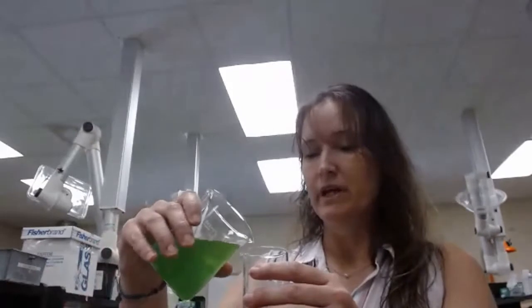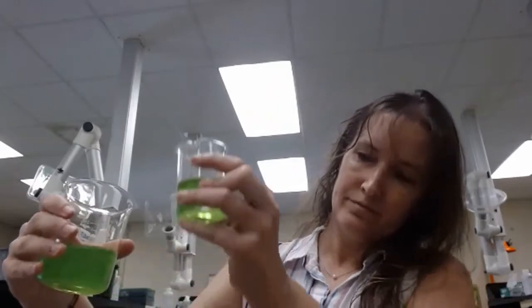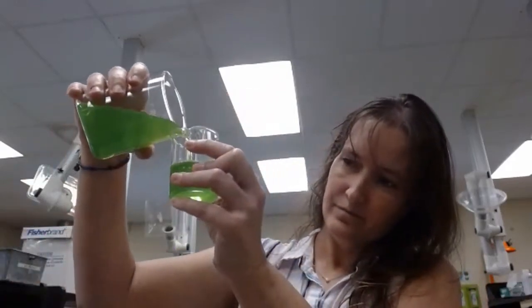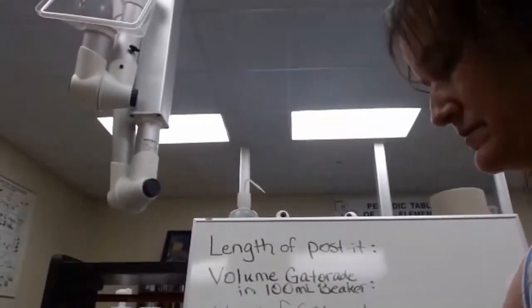So I'm going to pour some green apple Gatorade into this beaker. Then I'm going to set it down.